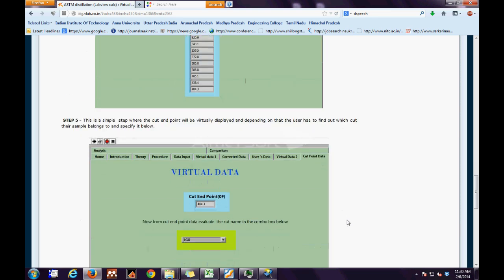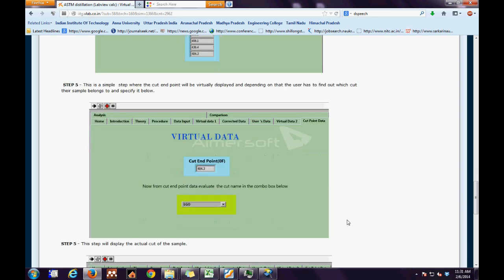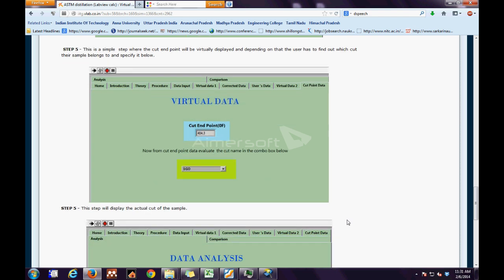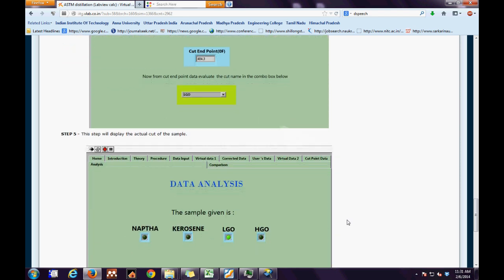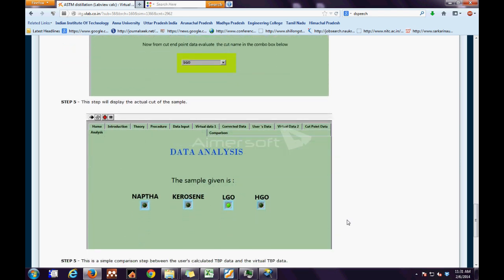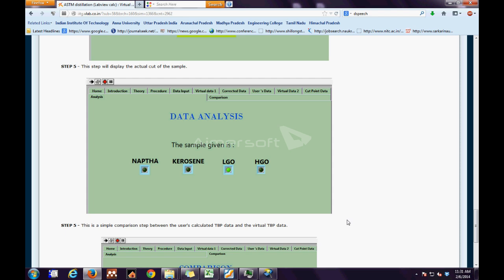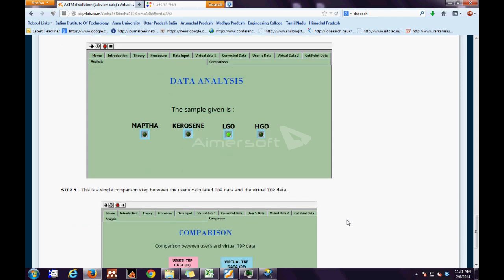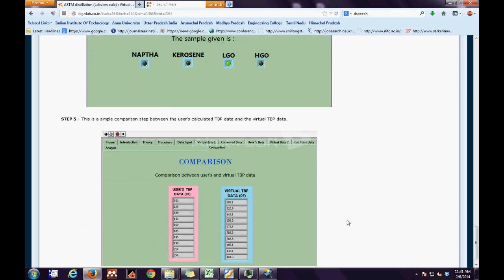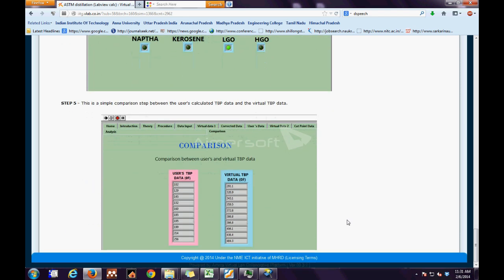The next step gives us virtual data for TBP. In the following step, the virtual data for cut endpoint will be displayed. Finally, the actual cut of the sample will be displayed. The last step is a comparison step between the user's calculated TBP data and the virtual TBP data.